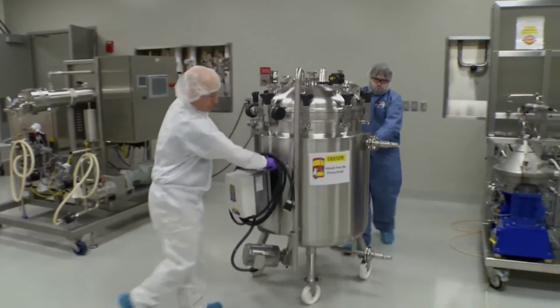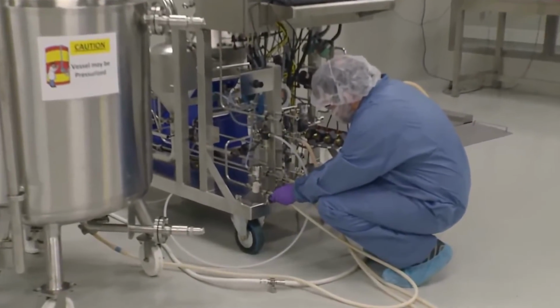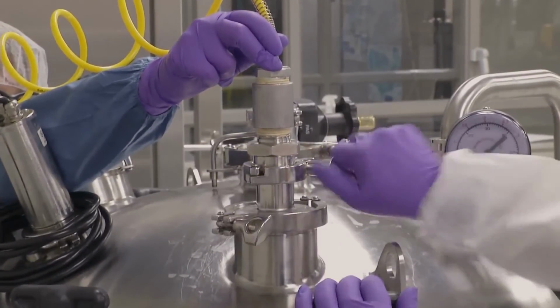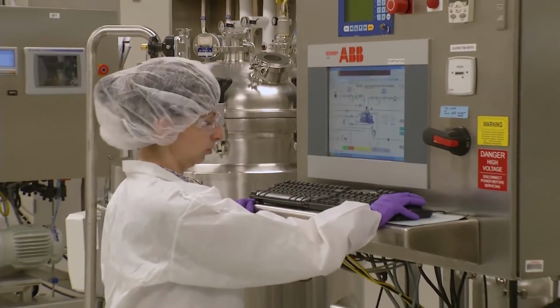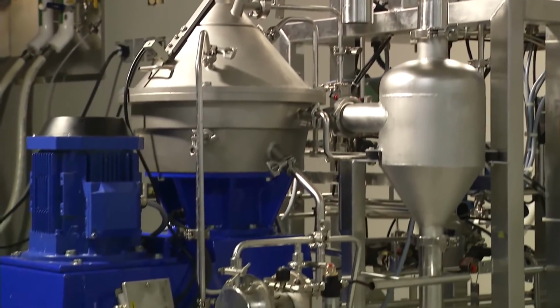GFP recovery begins with the arrival of the broth tank. A sterile hose is run from the broth tank to the disc stack centrifuge, and the tank is pressurized to drive the broth into the centrifuge. After the centrifuge has reached a stable running speed, the inlet valve is opened and broth enters the bowl.